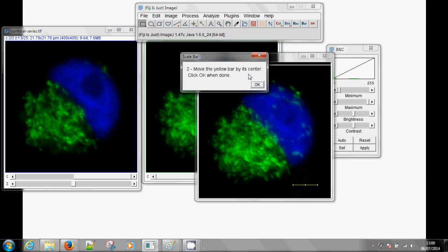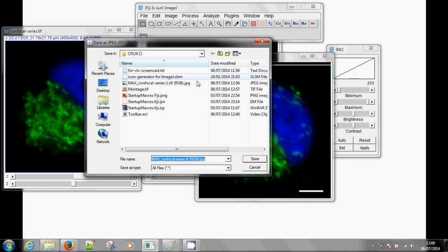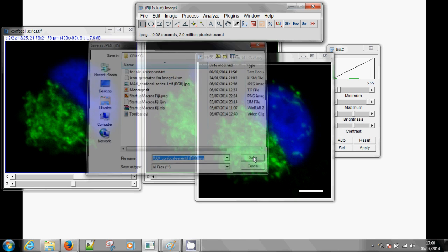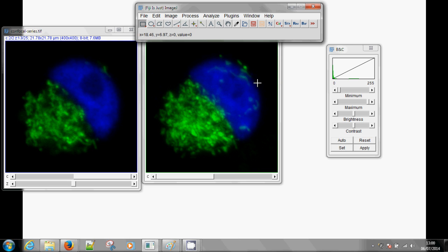And then for instance, draw a scale bar. This is a function that allows you to move a fixed size bar, and then you can get the value it corresponds to, here the size 4 microns, to be able to put it in the legend of your image. And then you can, for instance, save it as JPEG here, and then you just have to save. It's quite fast, it's a bit faster than going to the file menu.